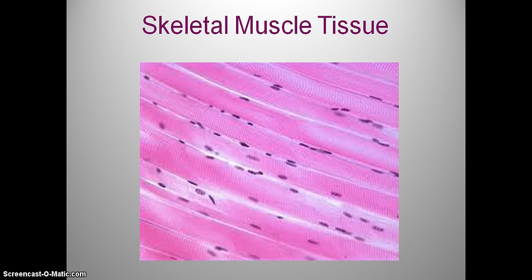We are going to go over the slides which you looked at in class. So let's look at the skeletal muscle. These are just fragments of the long fiber-like cells. Notice a few things. What are these? Nuclei, not one, multiple nuclei.